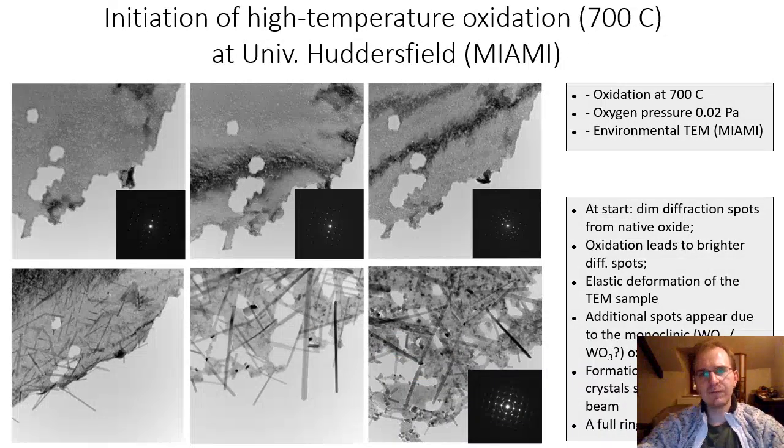Ultimately, we have conducted an in situ TEM study of the oxidation process with the MIAMI facility at the University of Huddersfield. These studies were conducted by my colleagues Graham Greaves, Stephen Donnelly, and Jonathan Hinks, and I also participated in some of the studies.